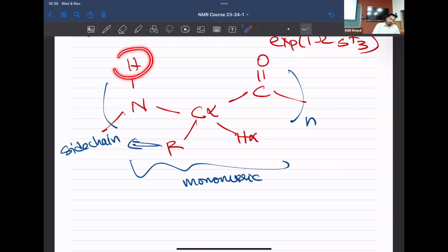And how would you end up going from the proton to nitrogen? All of you, I'm sure, are quite confident you can either do an SQC kind of transfer or an MQC kind of transfer, right? An HSQC will end up taking the Hz to something like 2HzNx or NY. And therefore, you get the frequency labeling on the nitrogen. Finish that, do the reverse INEPT to get it back on the proton. Therefore, you would have the proton resonance intensity modulated by the nitrogen frequency, which you infer from the interferogram, Fourier transform, and get the proton and nitrogen chemical shift.